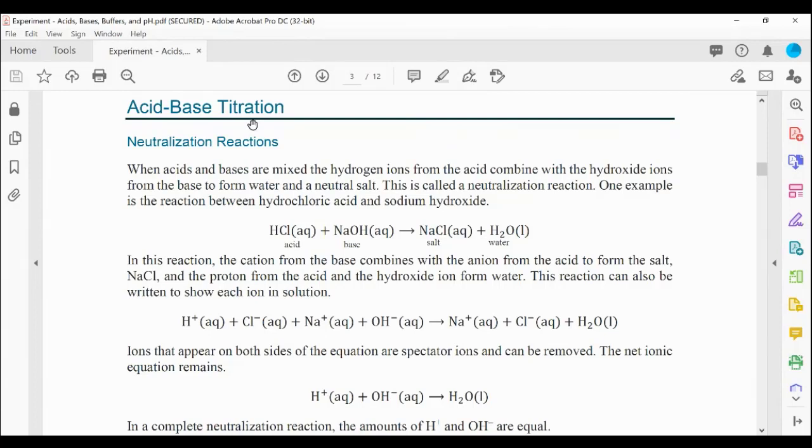In our case, we have vinegar. And we know that inside the vinegar, we have a percentage of acetic acid. We know, but we don't know how much. So we are going to perform a titration to know the concentration of the acetic acid, how much acetic acid is in the solution of vinegar. So it's just a method.